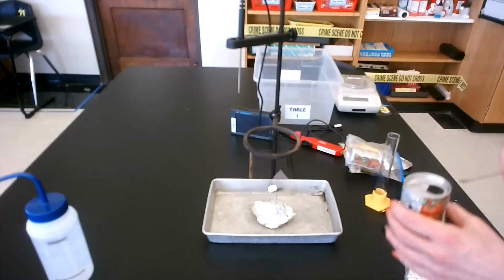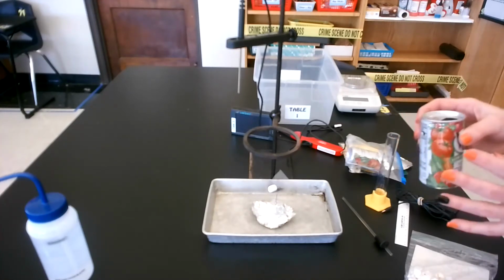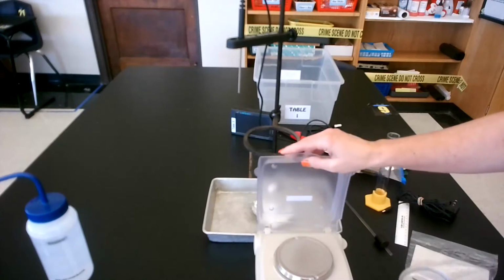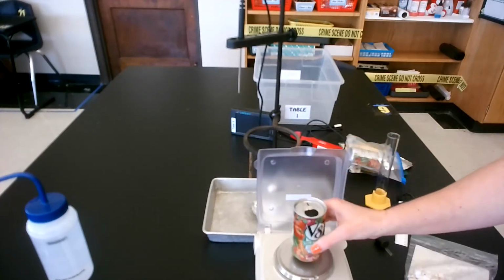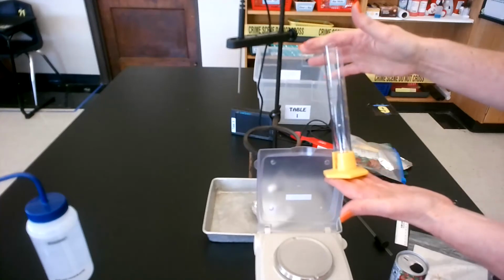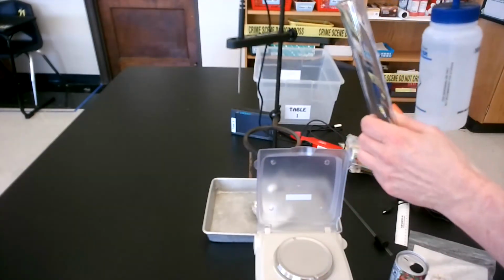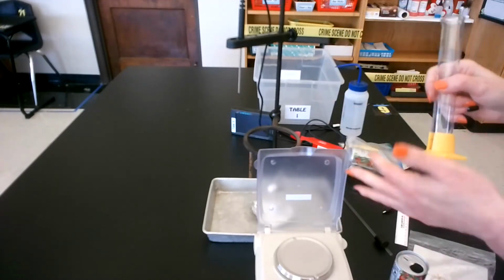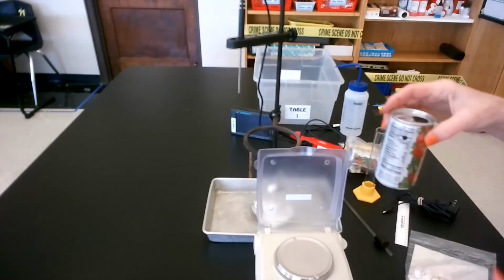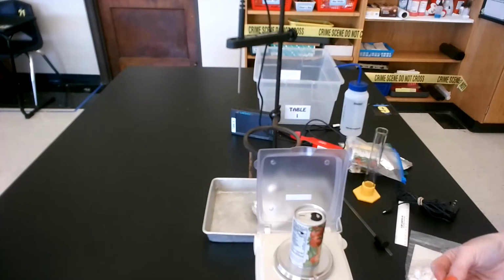So there's my height. Then I need to find the mass of my can and the mass of my water. Just like I did with the food holder, I'm going to get my electronic balance and find the mass of this specific can. That's why I numbered them. So there's the mass of the can recorded in my table. Then I'm going to measure out 50 milliliters in my graduated cylinder. This is a 50 milliliter graduated cylinder. I'm just going to use my wash bottle and fill that up. We can have different people working on different tasks, so we can get the lab started. So I'm going to pour this in, and then, just like I did with the food holder, I'm going to find the mass of the can plus the water, and then subtract to find just the mass of the water. Okay?